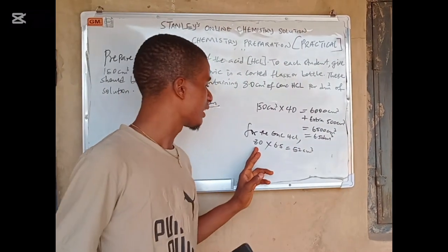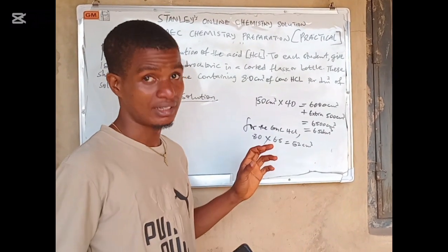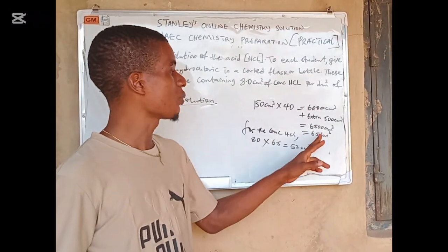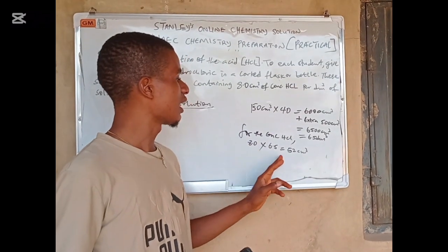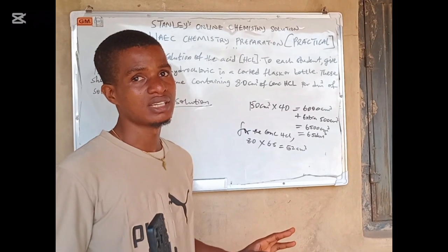We also added 4 cm cube of concentrated acid, right? Because normally 8 times 6 dm cube, 8 times 6 is supposed to be 48. So when we added half dm cube, we added 4, half of this. That is why it is 52. That's why we did 8 times 6.5 directly. 8 times 6.5 directly. Are you with me?